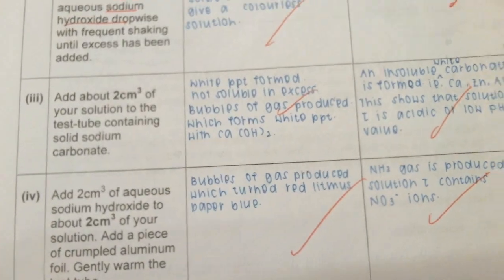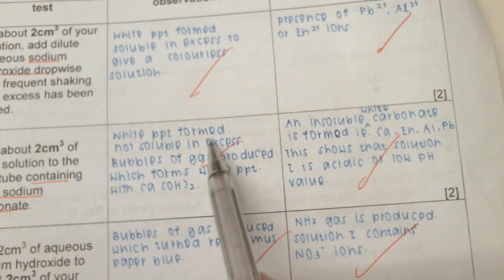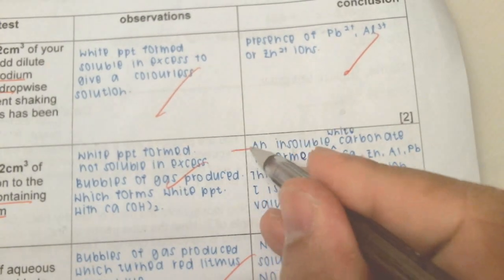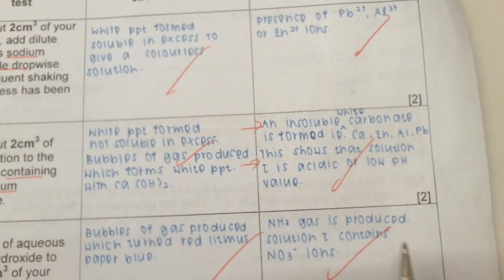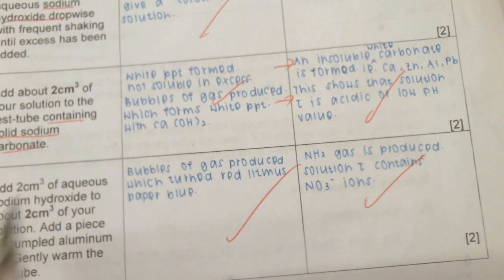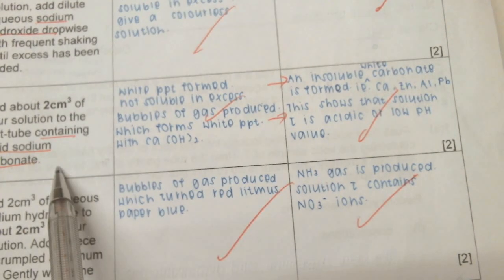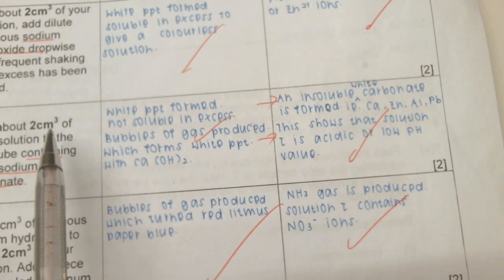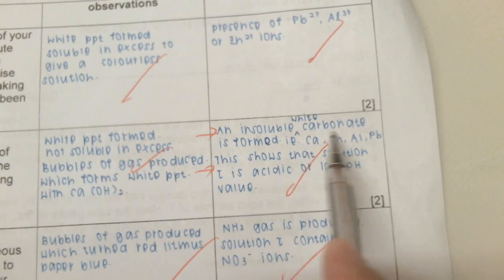And then you are asked to do something quite unusual. That is solid sodium carbonate. And then you see a white PPT formed. Calcium hydroxide has also produced a white PPT. Here you can get two deductions. It might be quite difficult for you to deduce at this junction, but it can be done if you think about it carefully. In this case, the sodium carbonate, which is one of those soluble carbonates, has produced the carbonate ions, and the carbonate ions will form a soluble or insoluble carbonate with the cation of solid T. That's why you see an insoluble carbonate formed.